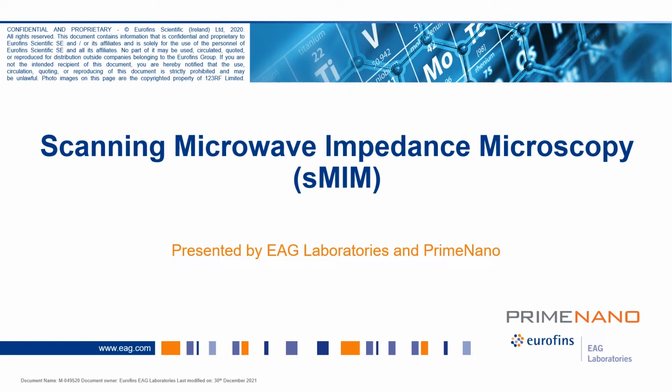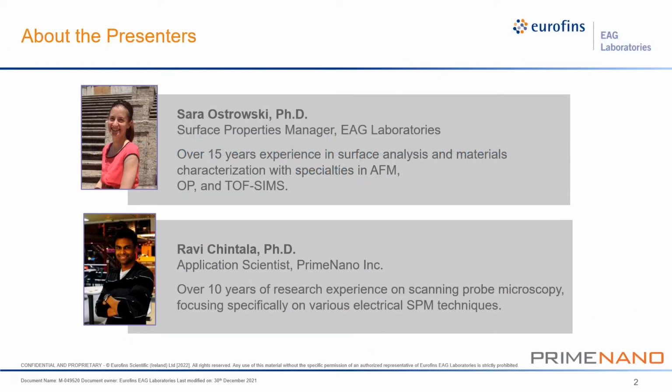The topic is sMIM, which is an advanced electrical technique of AFM, or atomic force microscopy. EAG just added this capability a few months ago, and we are happy to co-host this webinar with our vendor, Prime Nano, in order to present this new technique to you.